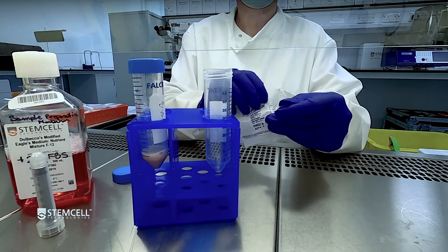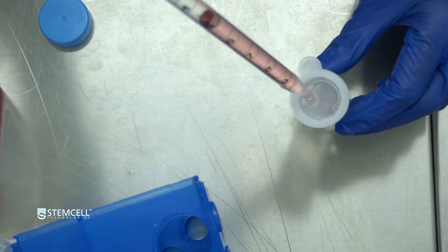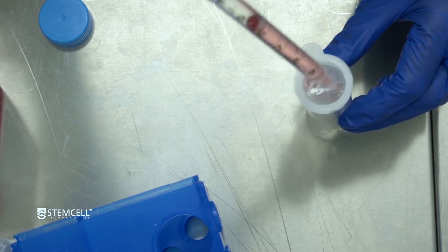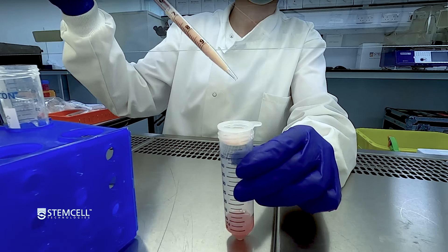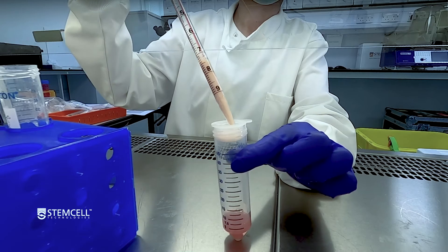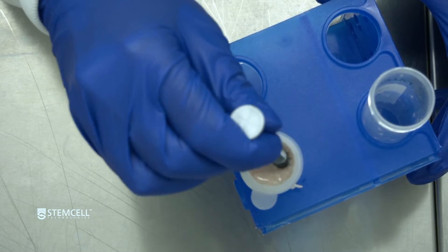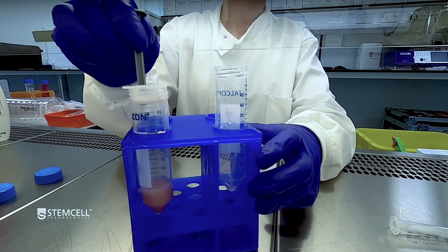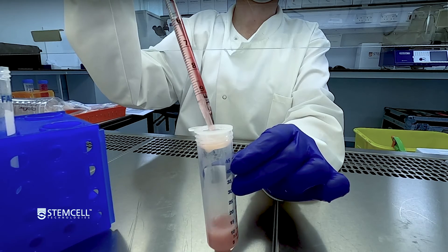Following the incubation, place a 70 micrometer nylon mesh strainer over a new 50 milliliter conical tube and rinse with sample preparation medium. Transfer the digested brain tissue into the strainer and push the tissue through the strainer with the rubber end of a syringe plunger to obtain a cell suspension. Rinse the strainer with additional sample preparation medium.